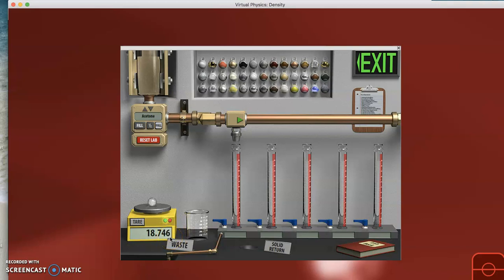Now you're going to notice that this number is going to fluctuate. That is something that you would see in a real laboratory. That is to the thousandths place. So what we see is it'll fluctuate with air, with people walking by, those types of things. So pick one of those and go with it. It's one of our uncertain numbers, and that's okay.